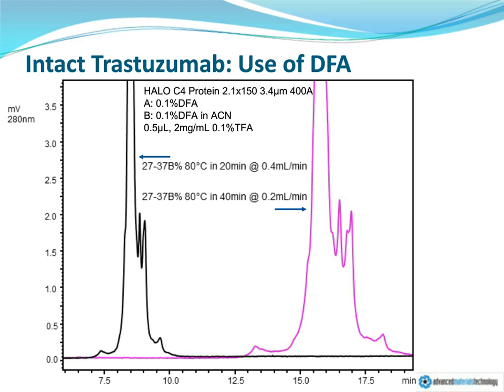And this is because even though we have gone to great lengths to improve the diffusion situation, that is the kinetic limitations of the separation, there are still limitations with respect to how fast you can move a molecule into and out of even a superficially porous structure.